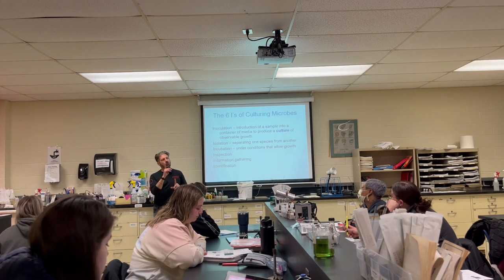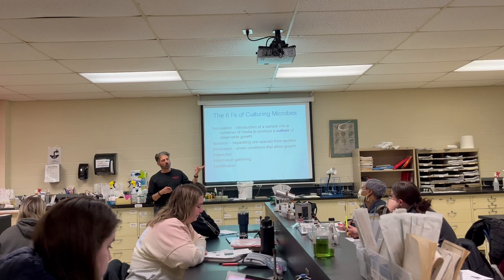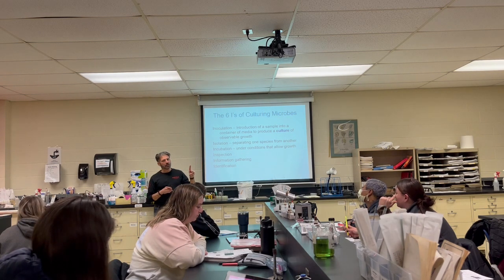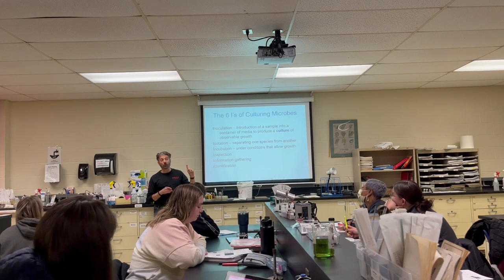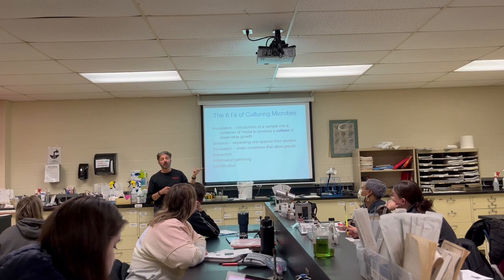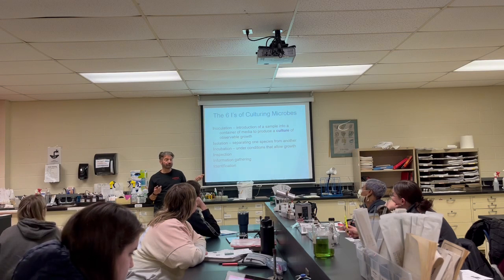The issue becomes if it changes color, or it gets a little bit denser, I realize something's growing in it. But can I tell if everything in that container is alive? No. I know something's growing, but I don't know if it's all alive because with bacteria, you can't take their respiration or pulse, right? I don't know if they're alive or dead.